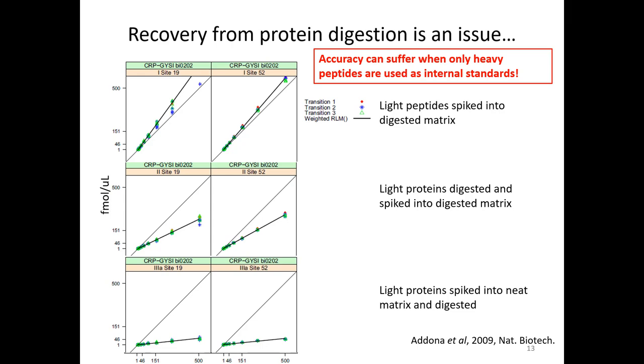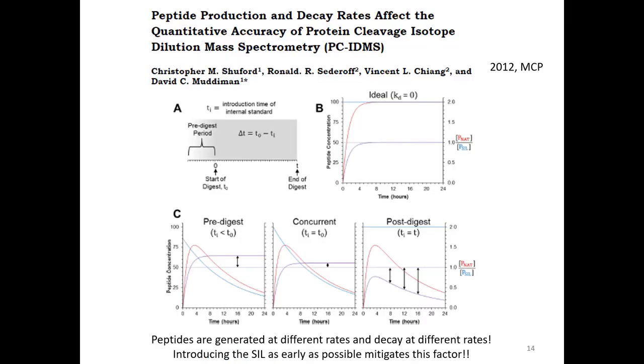So these are all things that you kind of have to take into account when you're doing this. This paper came out a few years ago, I guess, where it was looking at, and Andy touched on this too, how do you know when your digestion is complete? At this point, at least I always go for, is it reproducible?